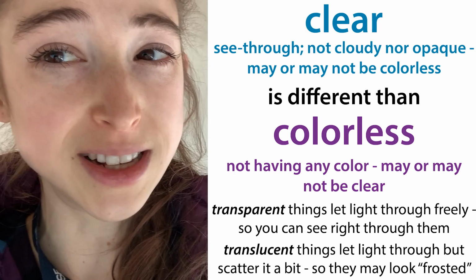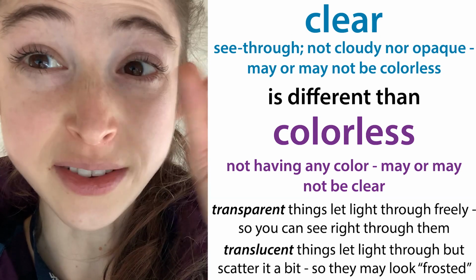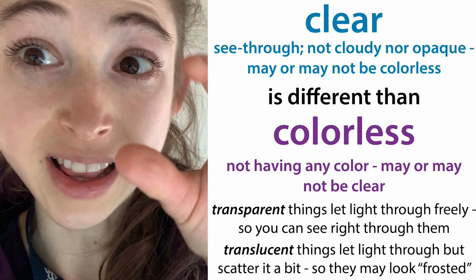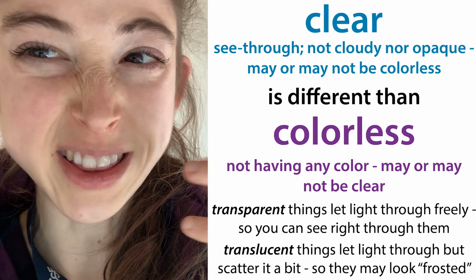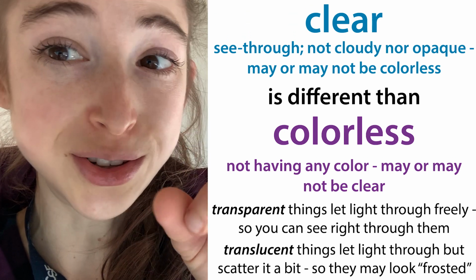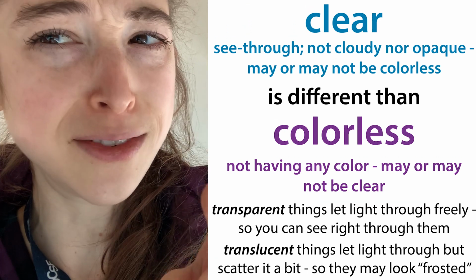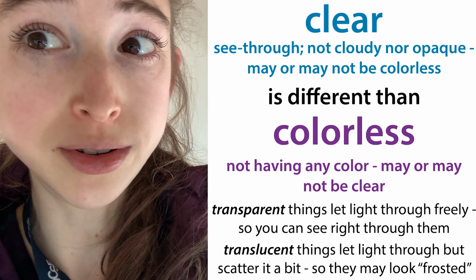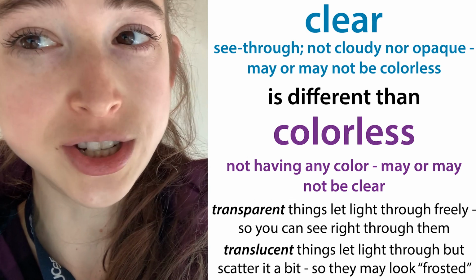So that wasn't a great example, because thanks to all of that stuff suspended in the liquid, not in the solution, but just floating around in there, it's going to look kind of white. The gunky stuff's kind of white. But the liquid part should be colorless, or at least it definitely should not be blue. It might be kind of yellowish, because when you have a bunch of proteins, things tend to look yellowish.